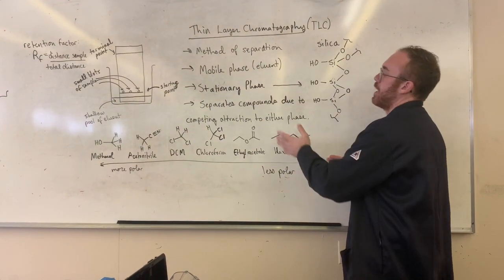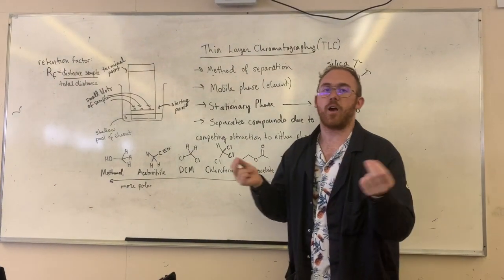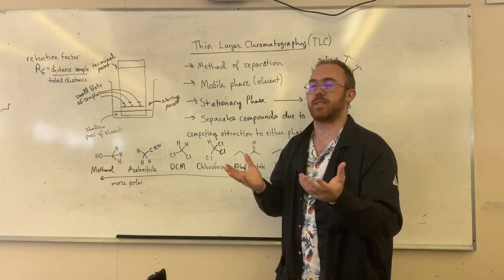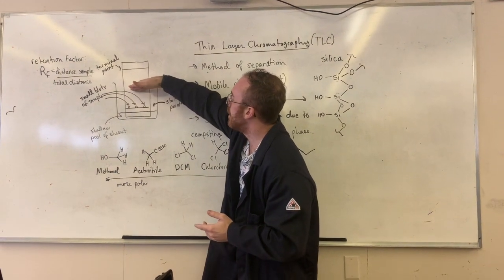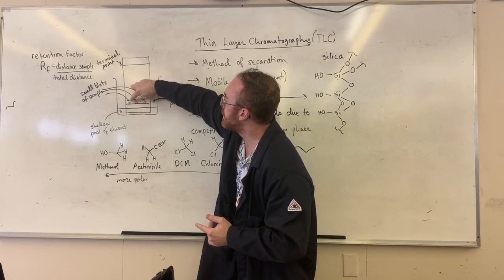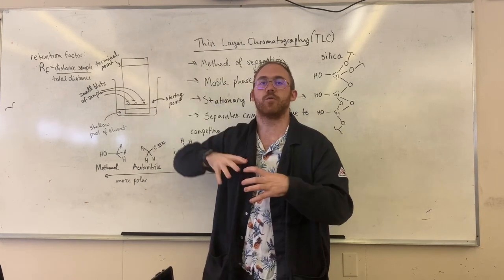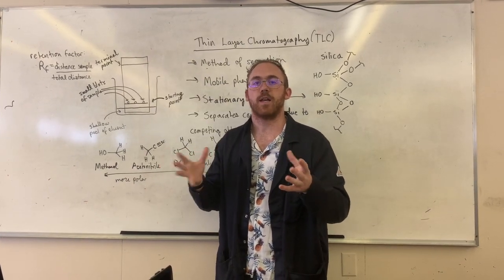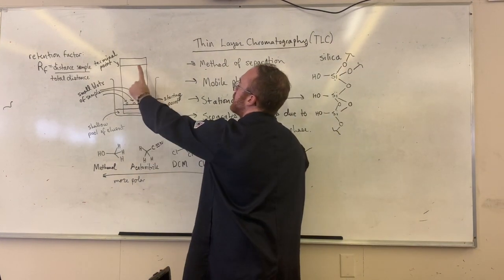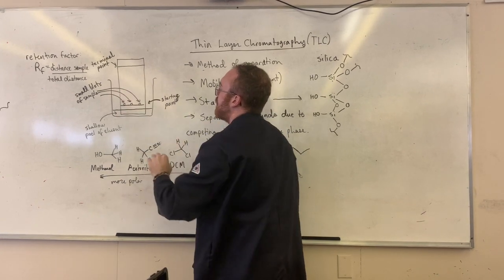So if you have a variety of samples, you can basically see one by one how they fared in the race. If you have a race that ends too early, let's say if you stop the eluent too far before you start, you don't have a good idea of the true difference in polarity that these compounds have. You want them to run a nice far distance in order to actually observe their differences in polarity and their relationship with the eluent, which is dissolving them and moving them up the racetrack, versus the stationary phase, which is actually holding them fast and preventing them from moving quickly.